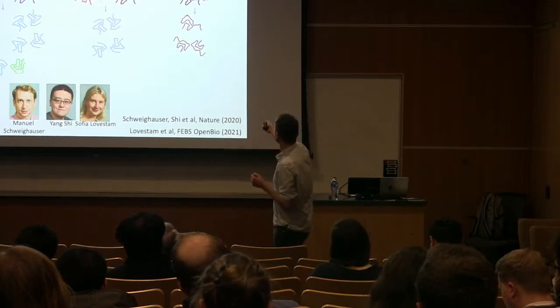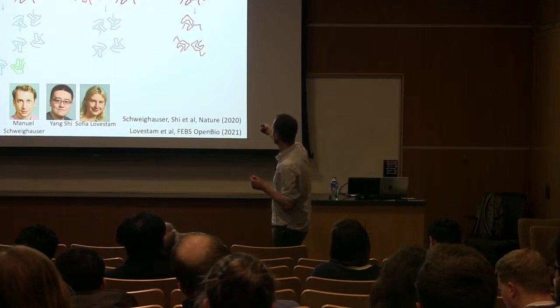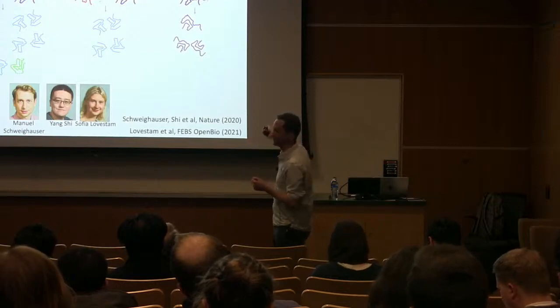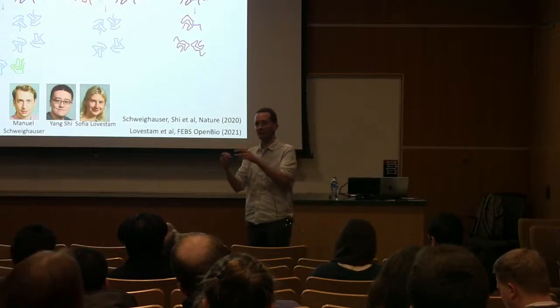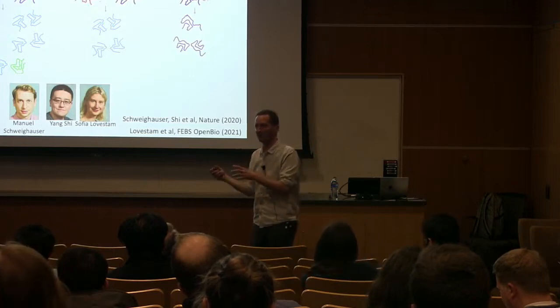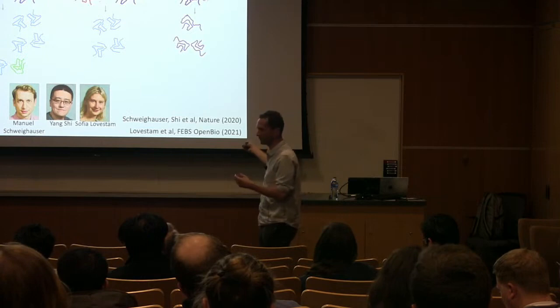And if you use the case which only had these type 2 MSA filaments, she could replicate half of the structure. So we think that also here there is a cofactor in the middle that may have been missing from our in vitro assembly reaction, because we don't know what it is, which could be an explanation why we only get half of the structure.